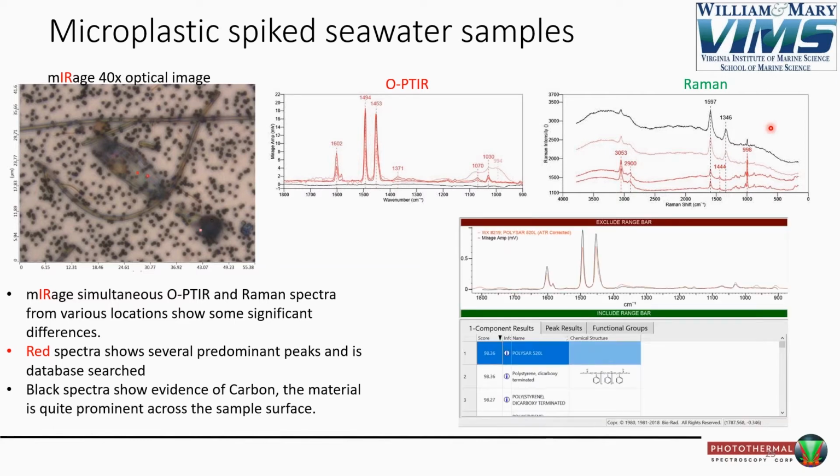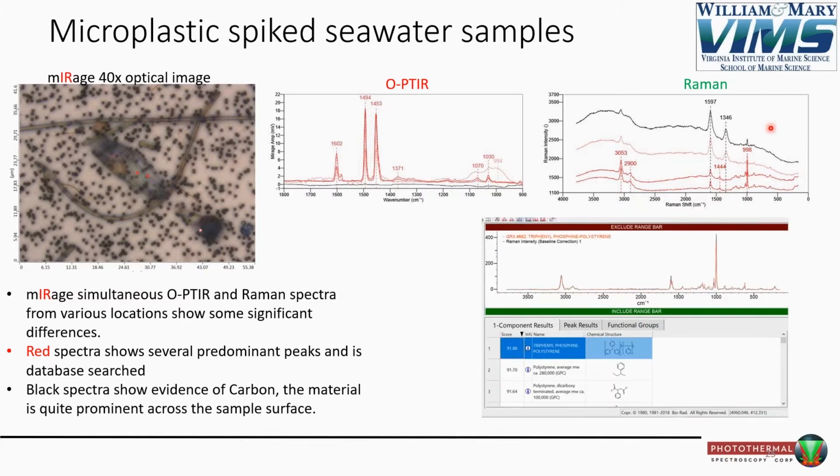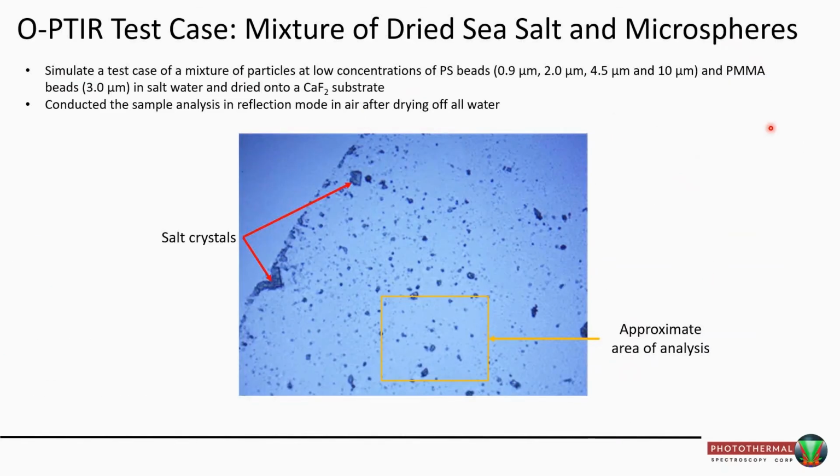Right, and these are the live search results for polystyrene for the infrared and for the Raman, and the rows show high quality number one hits.